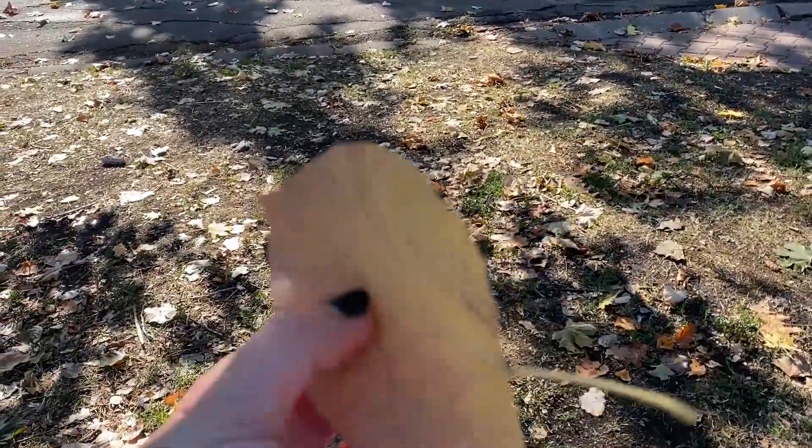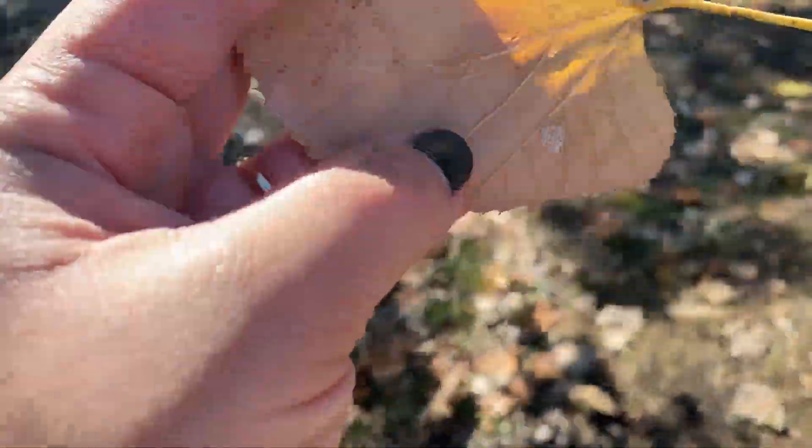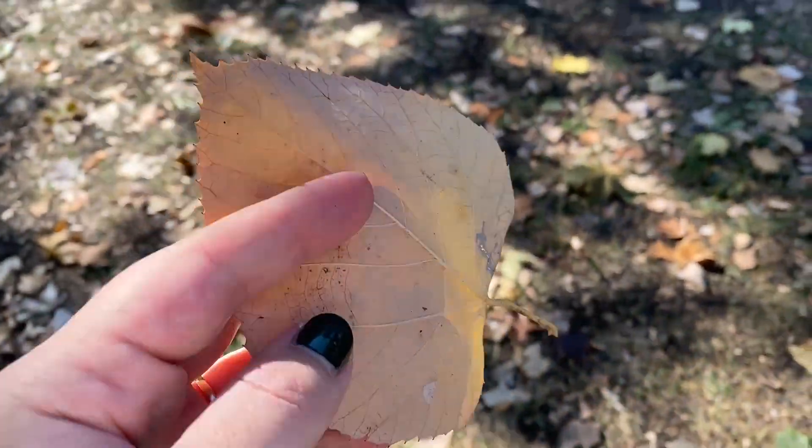My pockets are full of leaf samples, and I only have this one in my hand because we don't want to ruin it — can't put it in my pocket.